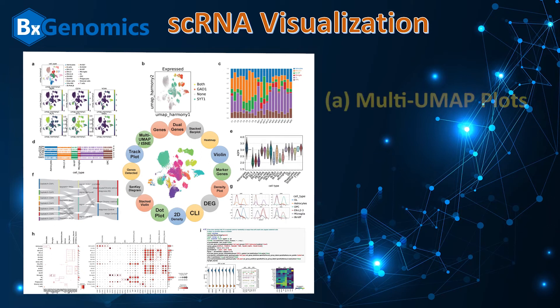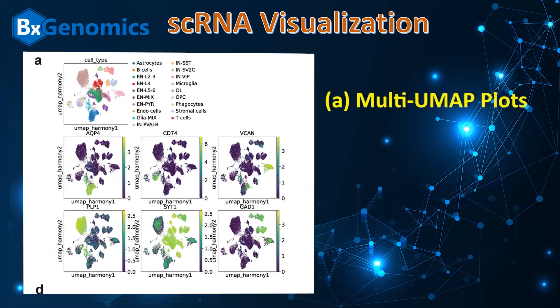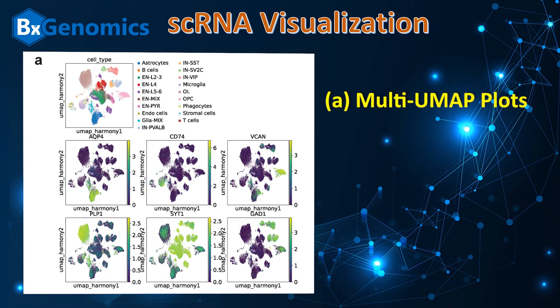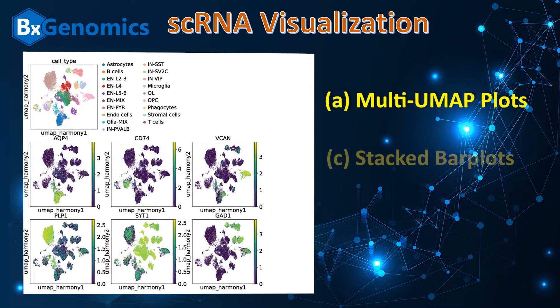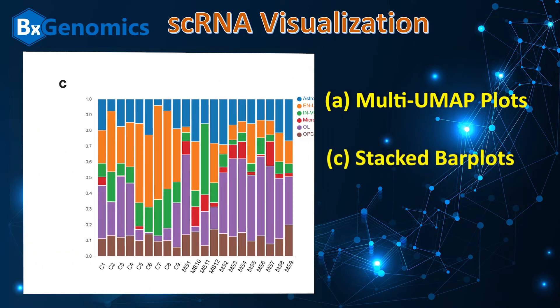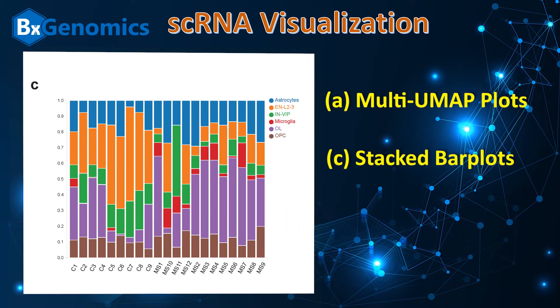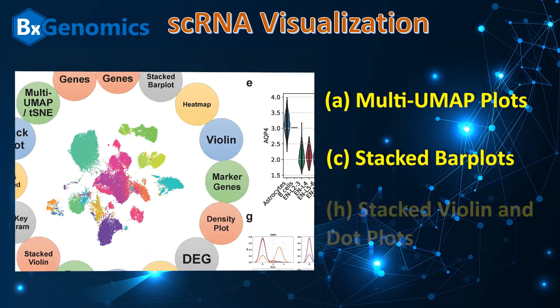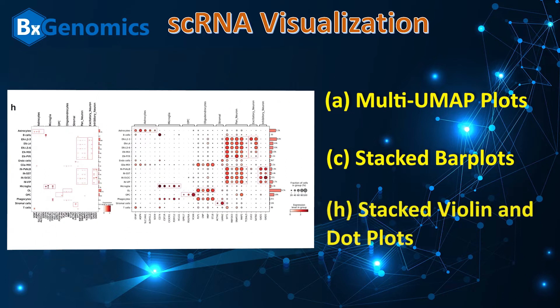Just to name a few: multi-UMAP plots highlight cells with cell type markers; stacked bar plots demonstrate the fraction of each cell type across samples; and stacked violin and dot plots are the key visualizations of selected cell markers across cell types.